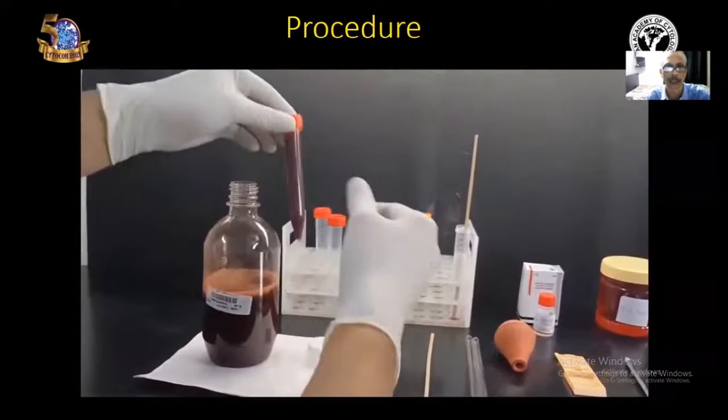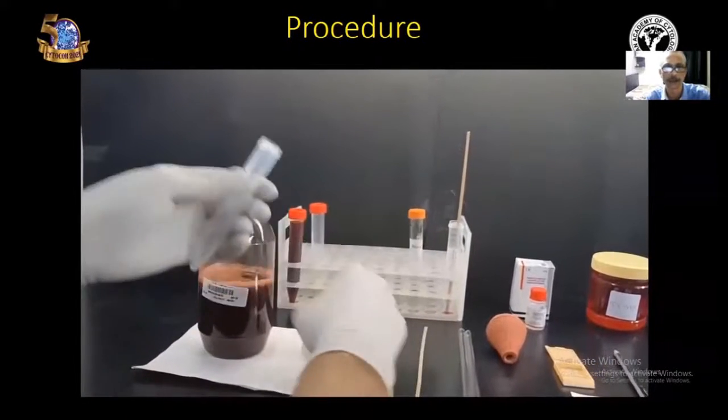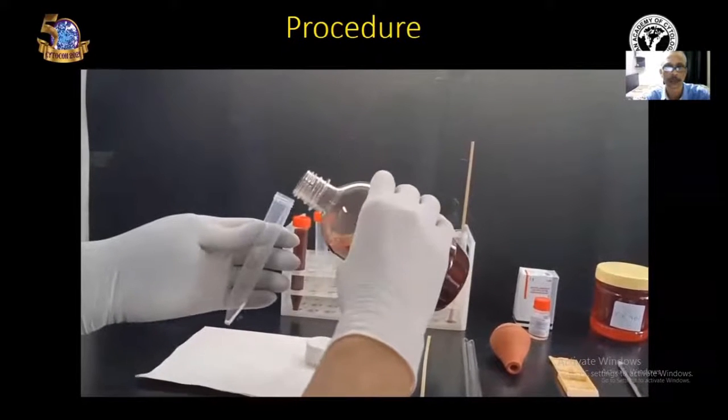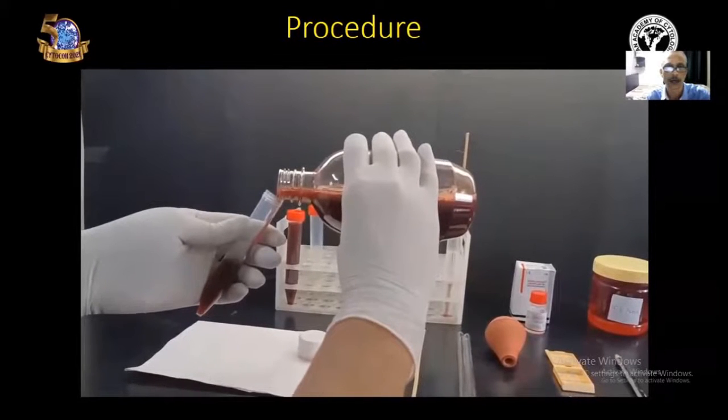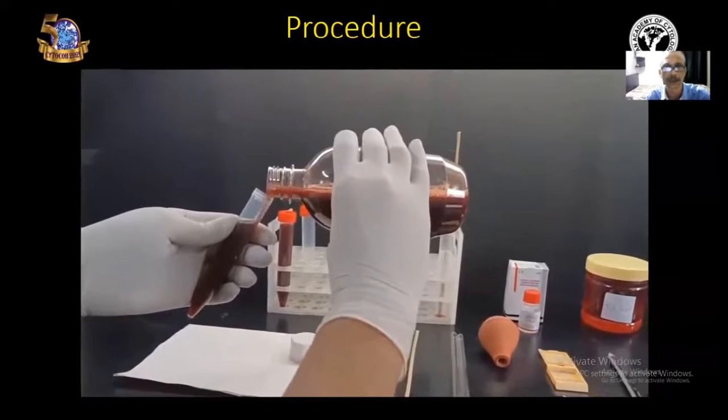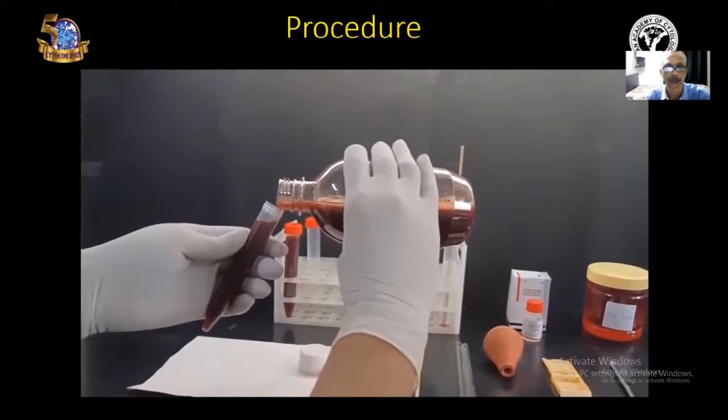Now take another centrifuge tube and fill it with fluid sample. Slowly we have to fill, and once it is filled, put the lid.